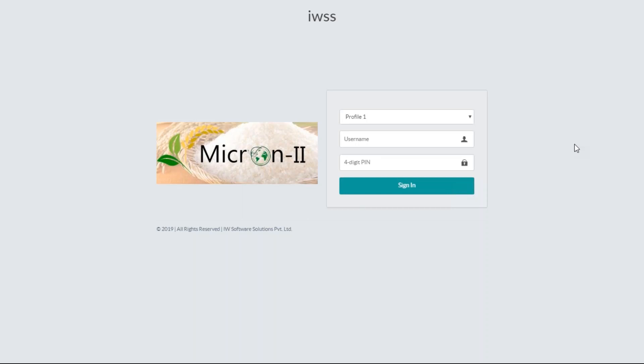Micron is basically a rice quality analysis system. It does rice quality analysis based on the physical characteristics of rice, like average length of your sample, whiteness — that is the cat whiteness value — then the weight percentage of chalky grains, damaged grains, discolored grains, and your complete grading based on the physical characteristics.